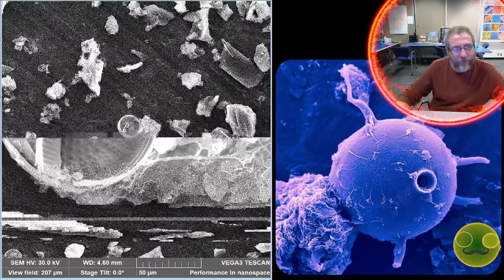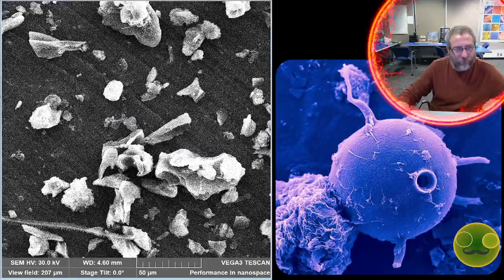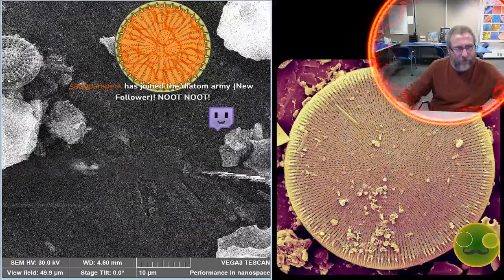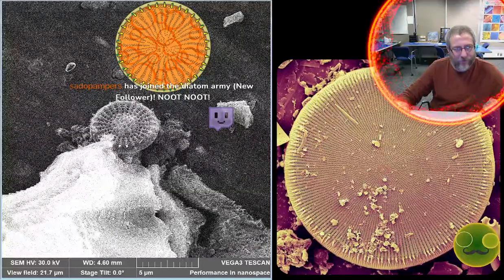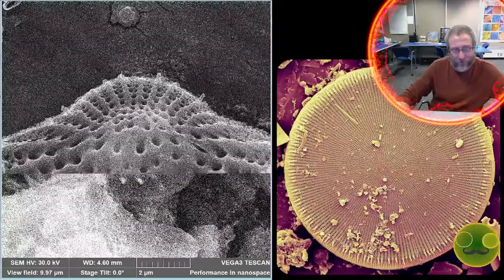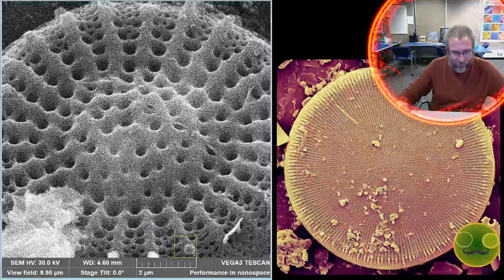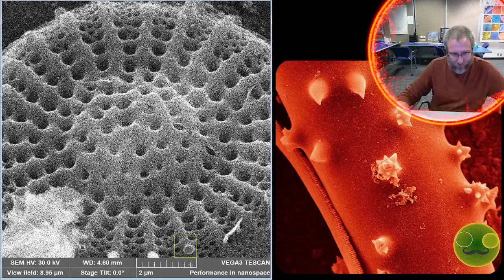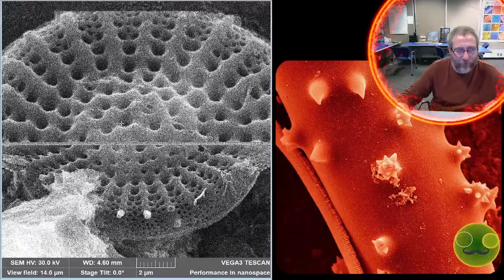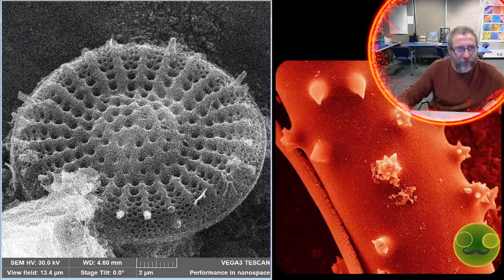A lot of the same stuff we've already seen. That one's nice and clean, but it's also probably not going to image very well. There's another Steph right here. I can get it to move to the center. This is a different species than the one that we looked at before, I'm pretty sure. It has a different characteristic appearance. It still has sort of a central hump, but it doesn't have all of the huge ridges, and we saw this big ring around the middle in the one that we were looking at before. It's not present here. The spines also have a slightly different characteristic to them, and the areolae are slightly different.